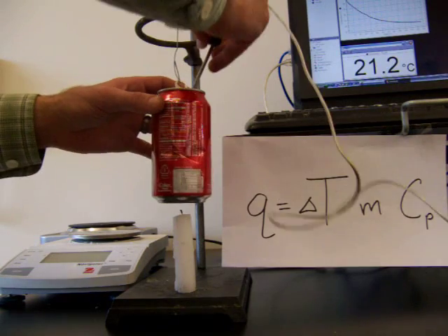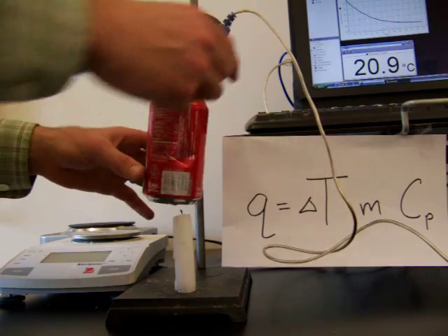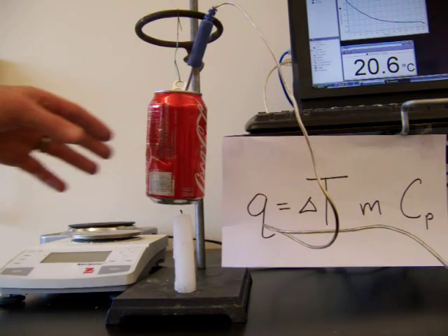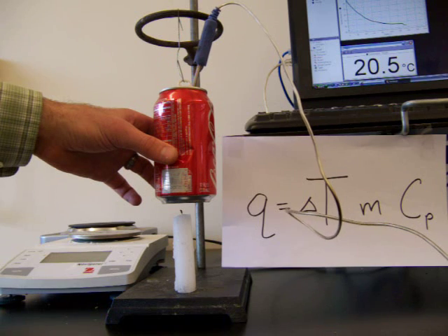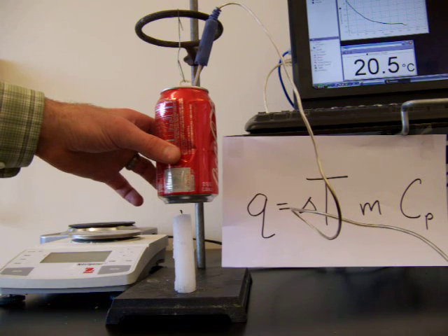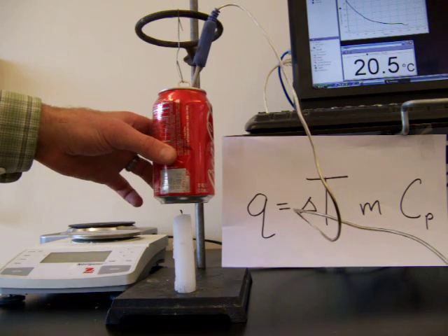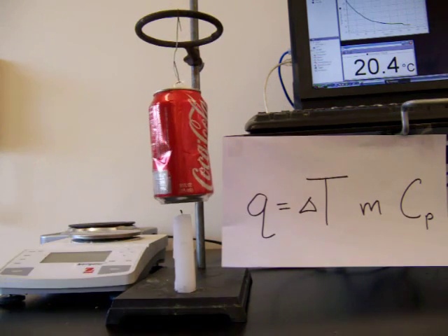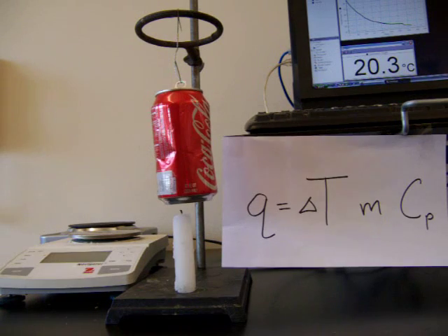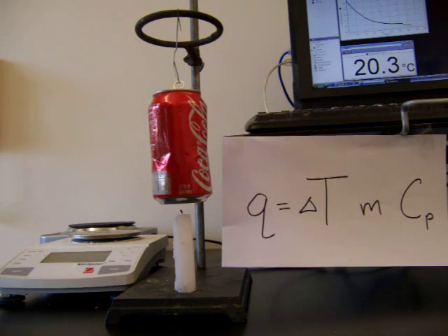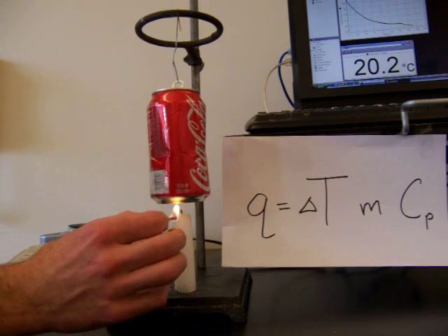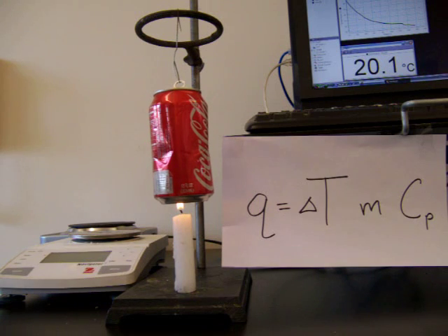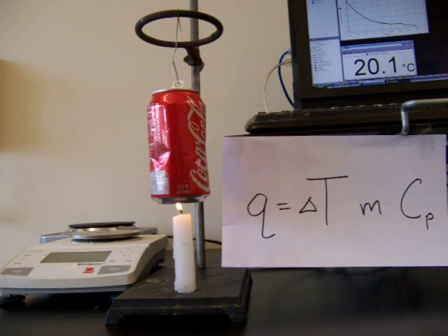Let's find the initial temperature of the water. So the initial temperature of the water in the soda can, it looks like 20.5 degrees Celsius is the initial temperature of the water in the soda can. So now let's light our candle. We'll light the candle, and we'll let it burn for about five minutes, and then we'll find the final temperature of the water.